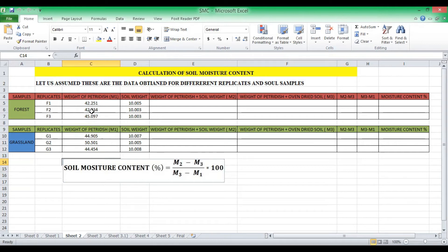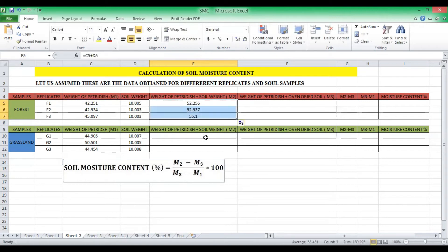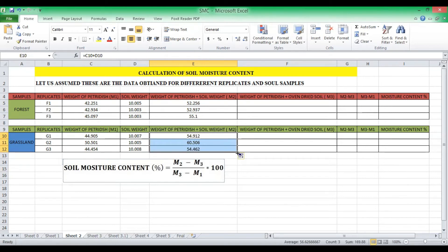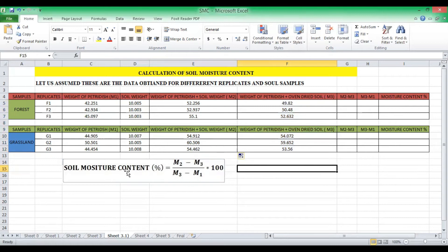In Excel, put an equal sign, then add the weight of the petri dish plus the weight of the soil to get the M2 values for forest area. Similarly, for grassland area, weight of petri dish plus weight of soil samples added gives you the M2 values. After 24 hours, we took out the petri dishes from the oven and weighed them. These values are the weight of the petri dish and oven-dried soil, which is M3.